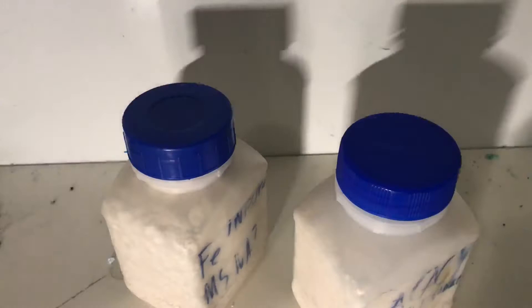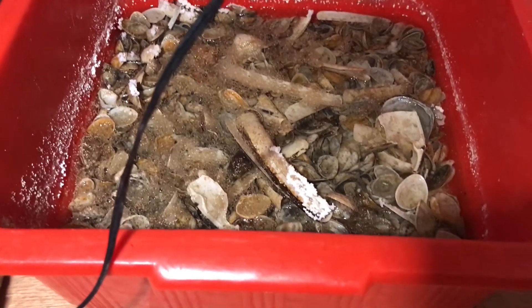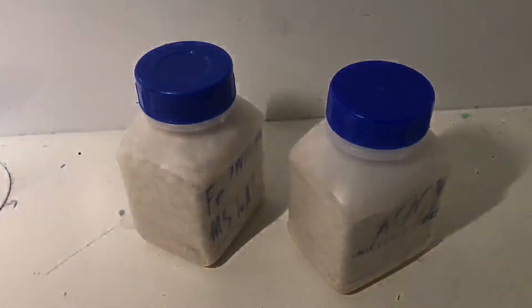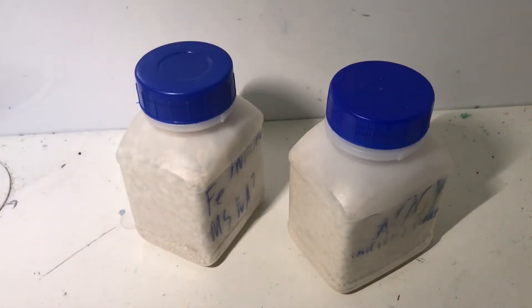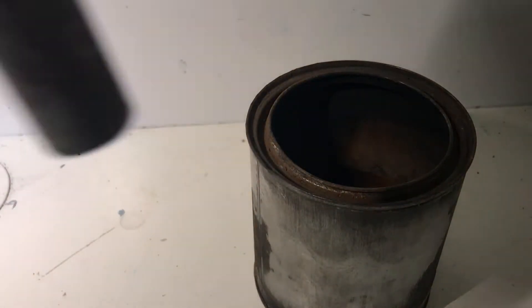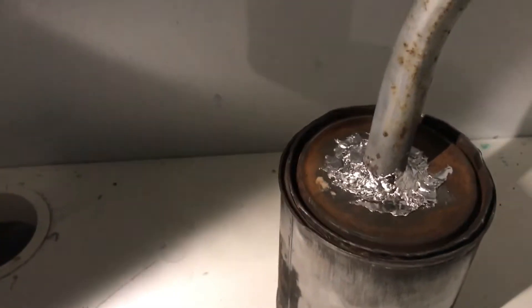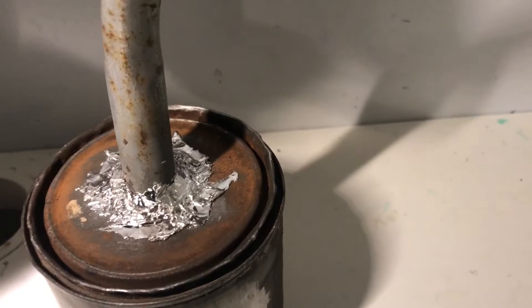Maybe I can show you real quick. Here I'm making more — as you can see, it's already kind of crystallizing. So I didn't want to use my glassware for the dry distillation, because it will probably wreck it. So I've made this dry distilling setup — just a paint can with some really bad seal and this pipe.